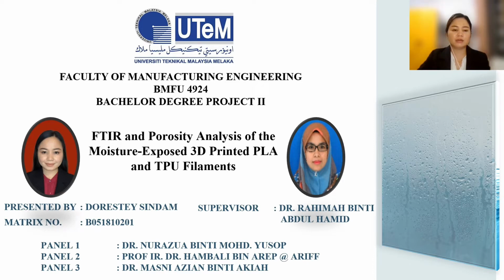B051810201. Today, I would like to present my bachelor degree project 2. The title is FTIR and Porosity Analysis of the Moisture Exposed 3D Printed PLA and TPU Filaments.